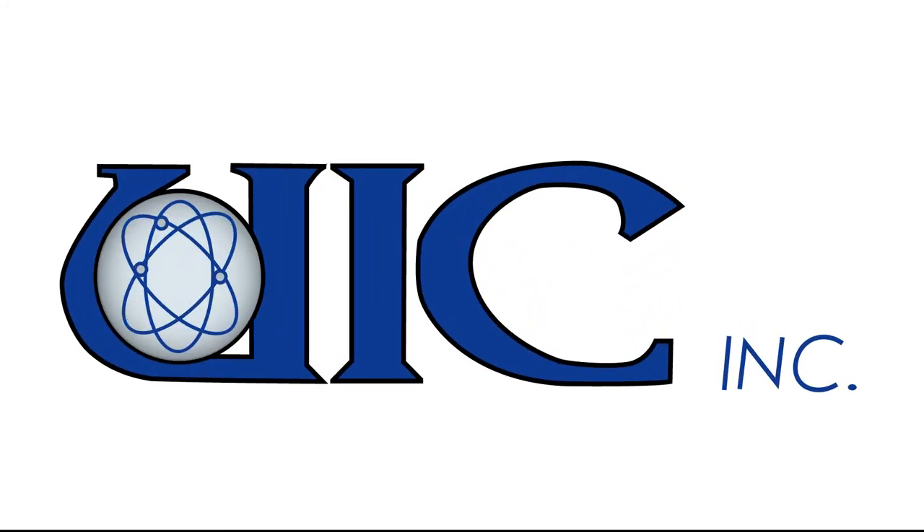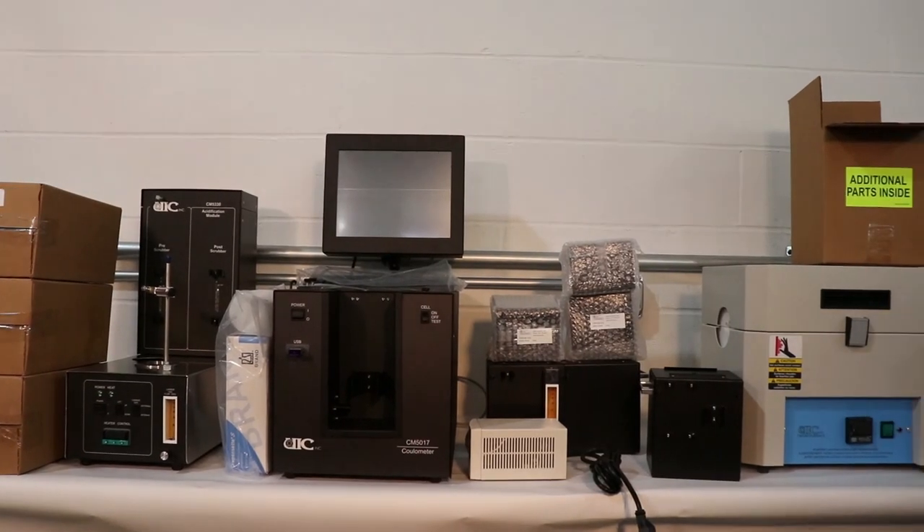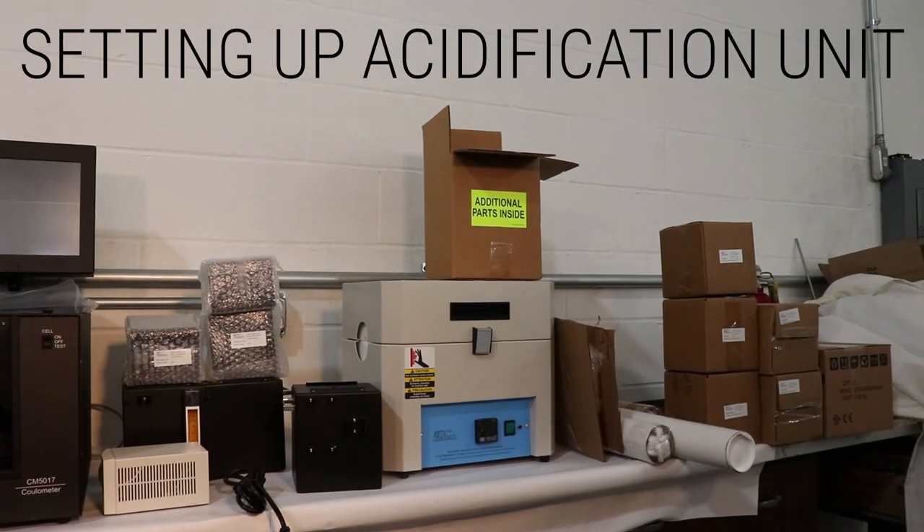Today we'll be demonstrating how to set up and use a CM150 system from UIC Incorporated to perform a total carbon and total inorganic carbon analysis by combustion acidification and coulometric detection.